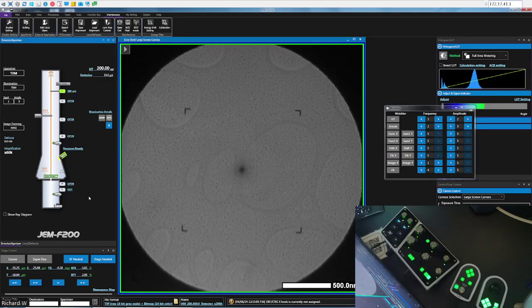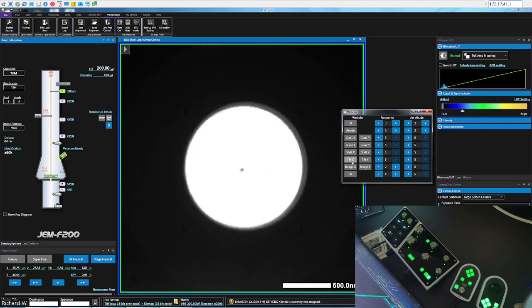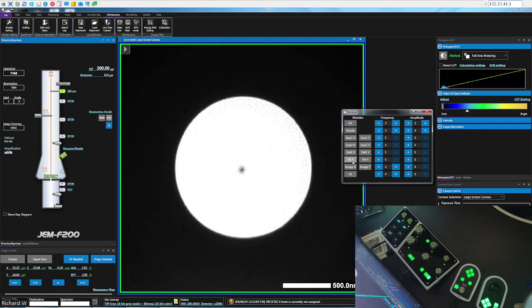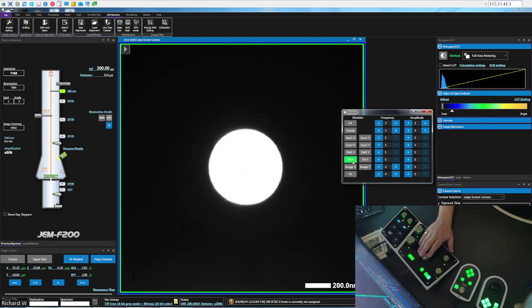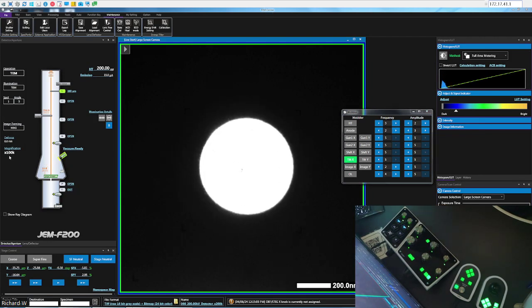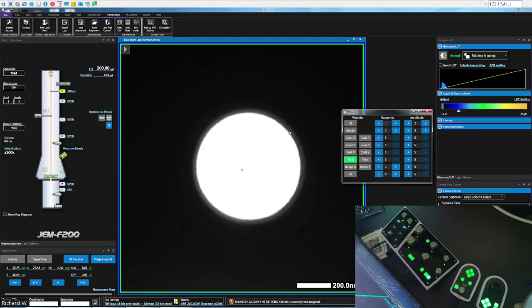Now the most proper way to do the HT wobble is to first make sure that tilt shift purity is corrected. The way we do that, there are multiple ways to do that, but we use the tilt wobbler. Okay. Now this is currently set up well. So from a magnification of around 100,000 times, we can see the beam here. And with the wobbler turned on, the tilt shifts slightly left and right.